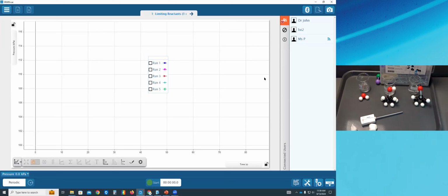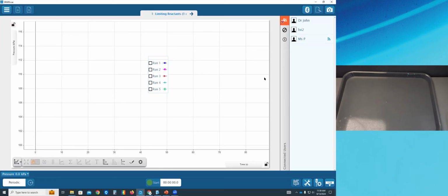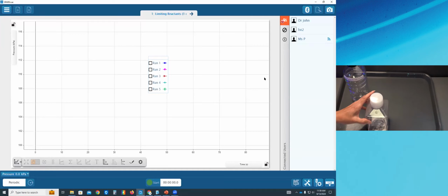I'm going to switch away and go to the setup, and I'm going to quickly swap out to a different lab, and we were going to do lab 8D. That was determining limiting reactants. This is one of our most popular labs. It's a stoichiometry lab, and I'll quickly explain what we do there in a second.